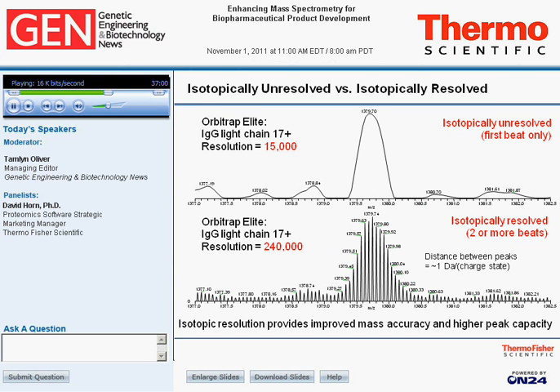Another added advantage of having isotopic resolution is that each of those isotopes is separated by 1 Dalton in mass, but because you detect the spectra in m/z units, you can actually tell what the charge state of that isotope cluster is by just measuring the m/z difference between any 2 of those peaks and then doing 1 divided by that, and that tells you the charge state. You can figure out the charge state of an intact protein based on 1 isotope cluster alone, whereas if you have unresolved isotope distributions, you will need to run a deconvolution algorithm. Next slide, please.